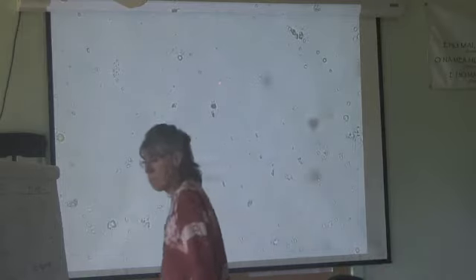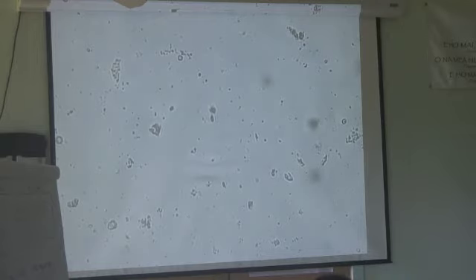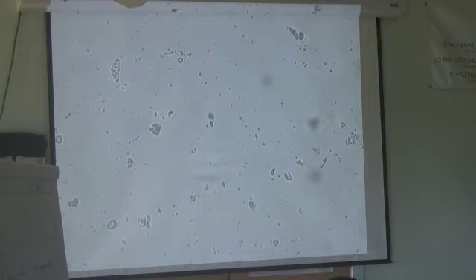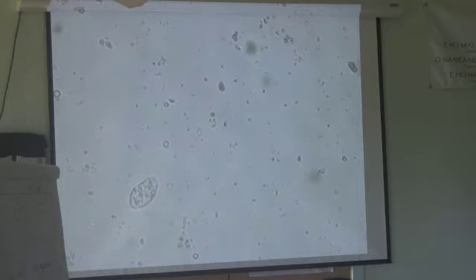In this kind of preparation, the morphology of that bacteria, doesn't it look like it's the same as that one? Probably not. No, and we're just not going to be able to distinguish all 75,000 of those different species of bacteria using morphological characteristics. So we have to do DNA analysis if you really want to put names on them. Is it really important to put names on these guys? All the other things in this sample are telling you that it's good and aerobic, so you've got a million different aerobic bacterial species. You know what we need to know. If we're trying to find what bacteria are strongly associated with strawberry, then we have to identify the species and we better have that DNA ability.